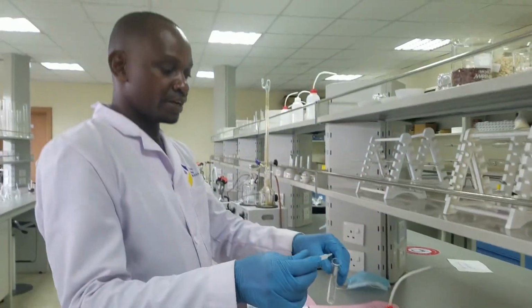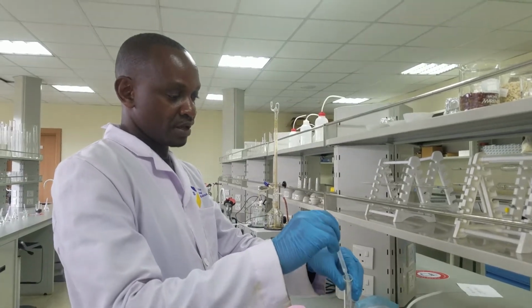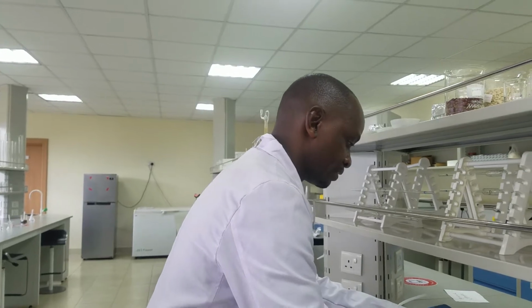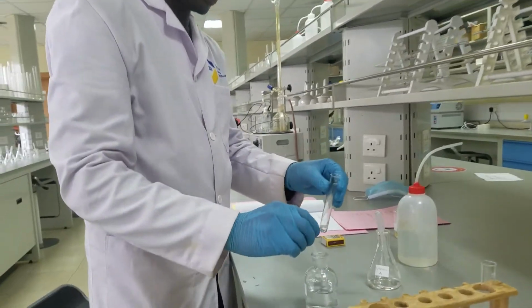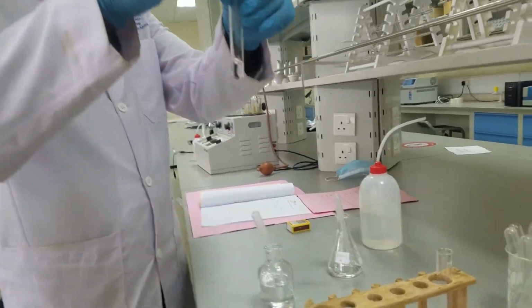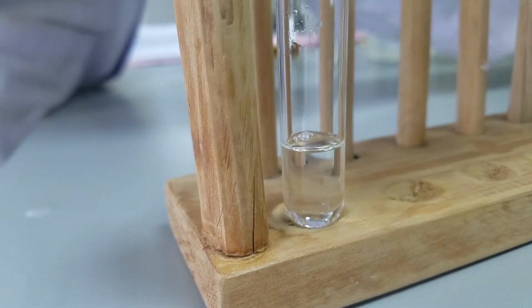Okay, then I will put a little amount of the unknown again, and I'll put it with DCM together, like that. I'll put DCM here, like that, and I'll put it here. Observe the difference.